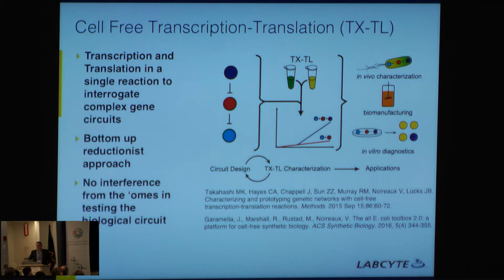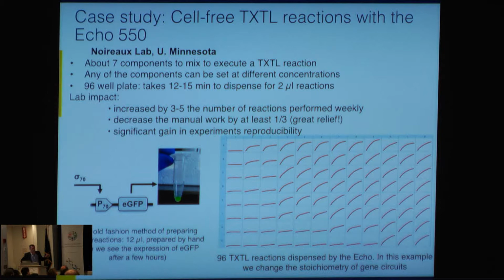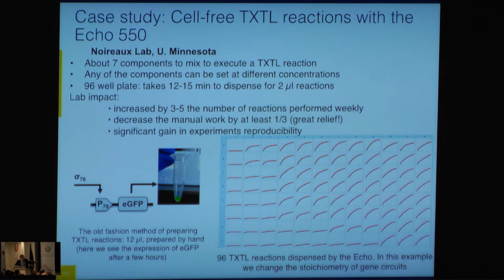In Vincent's module, Vincent highlighted the use of the TXTL reaction, transcription translation, which is a great breadboard for being able to test gene circuits in a cell-free manner. What we were able to do with his lab as well as the course was dispense all of the components necessary for the TXTL to take place. And given this example data that he generously provided, we were able to change the stoichiometry of the gene circuits and then read in real time the production of the GFP.